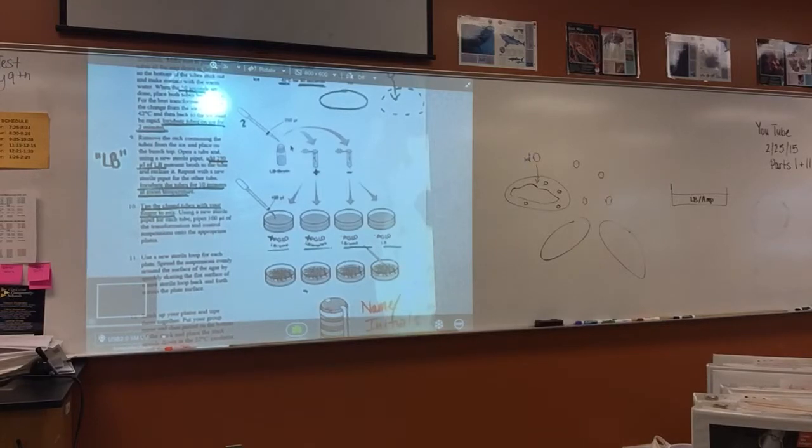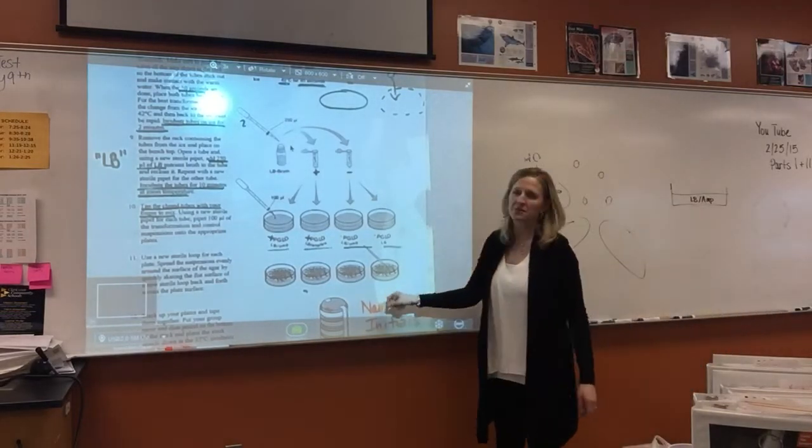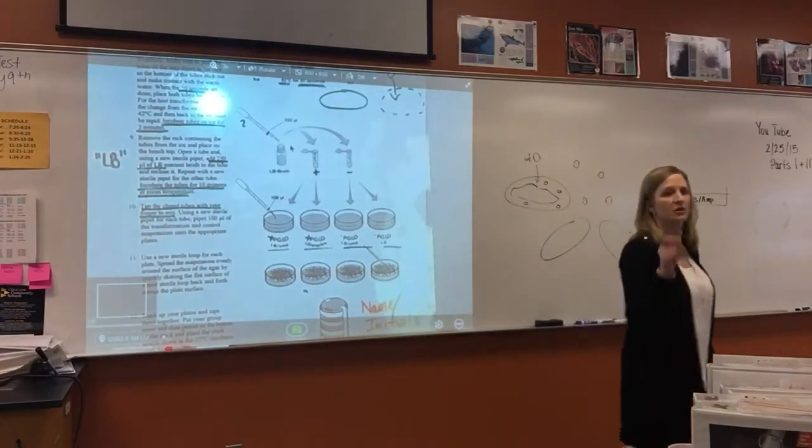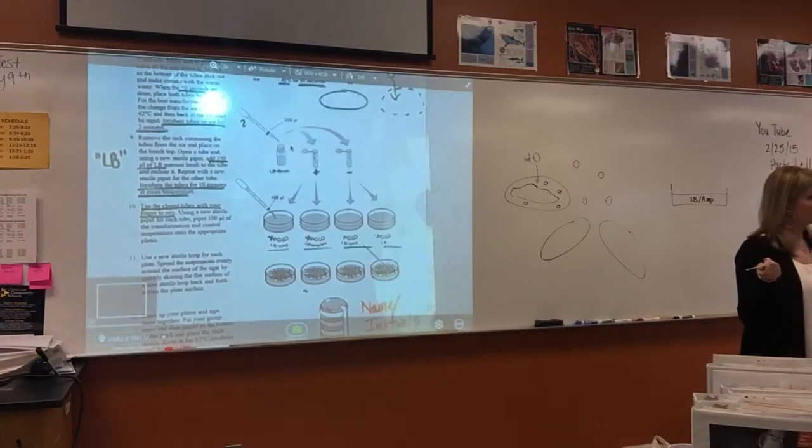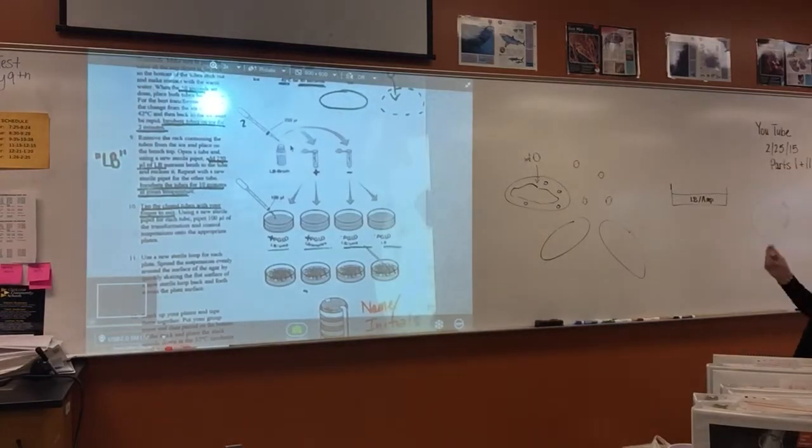We're going to masking tape them, so I'll have some masking tape available. You're going to tape them all together, and that's where you put your names for your groups, so that you can put them in the incubator in the back. They'll sit for 24 hours till the next day, and hopefully they'll have some bacteria that are transformed. So I just wanted to go through that, make sure you knew what everything was and where everything was going to be.